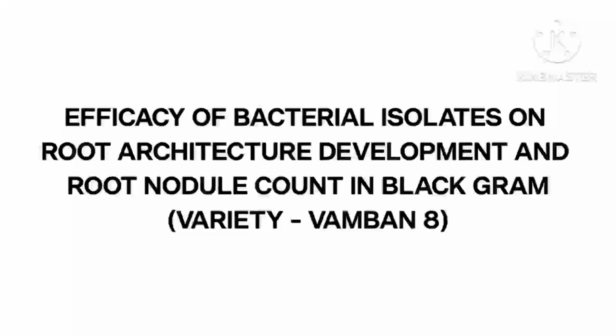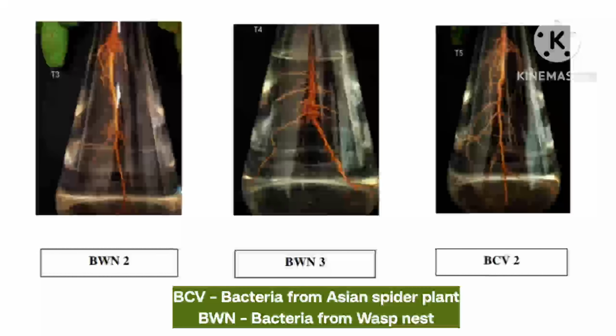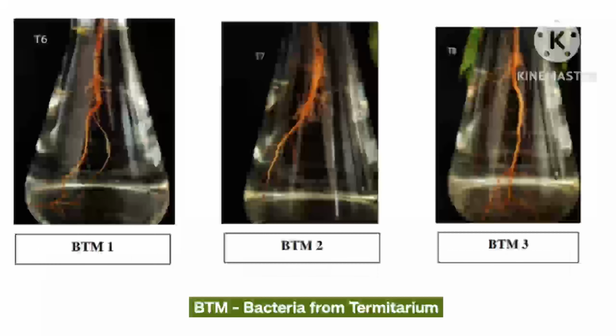Efficacy of bacterial isolates on root architecture development and root nodule count in black gram. The efficacy of each bacterial isolate on root architecture development and root nodule count in treated black gram seeds was assessed.